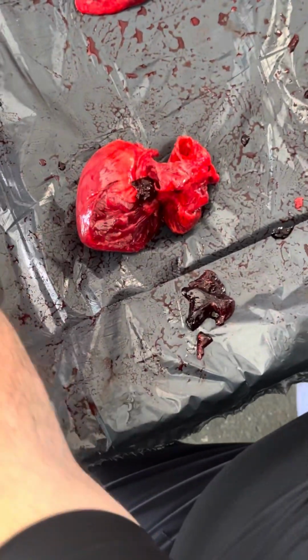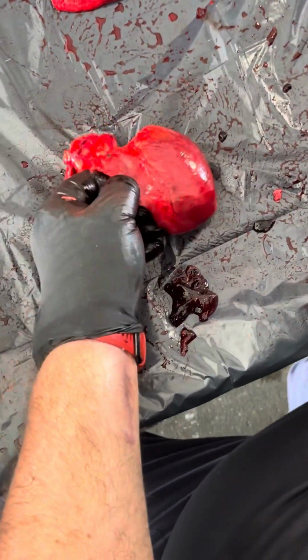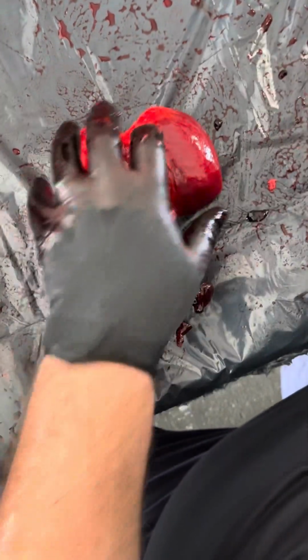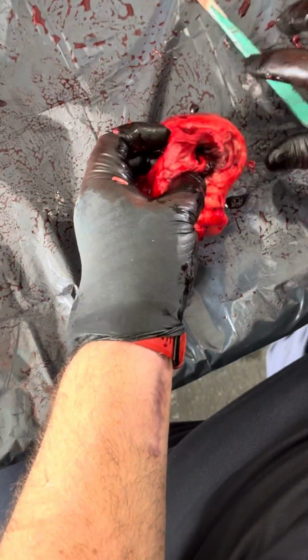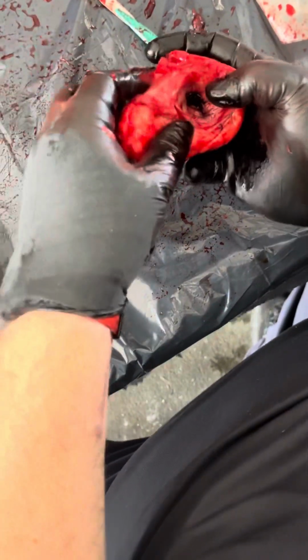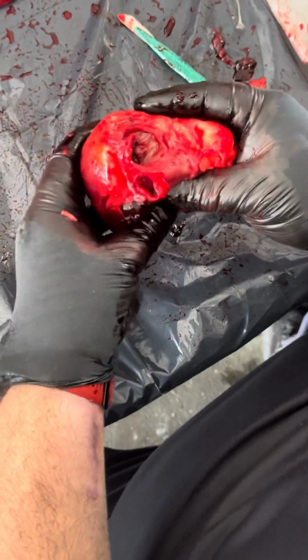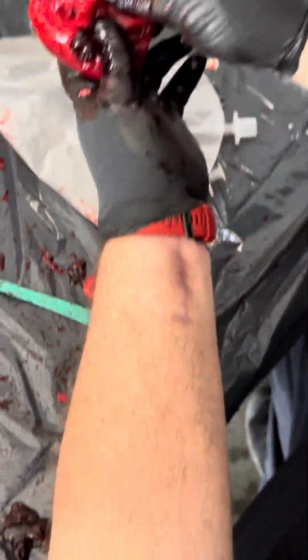All right, so there's your left. Now we're going to get into our bicuspid valve. Another big clot. On the inside here, you can tell this has two. There's one leaflet, two leaflets.